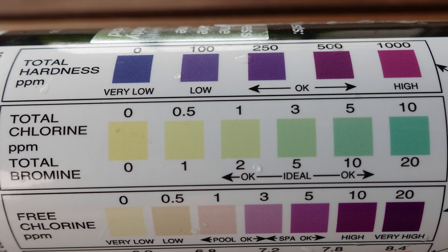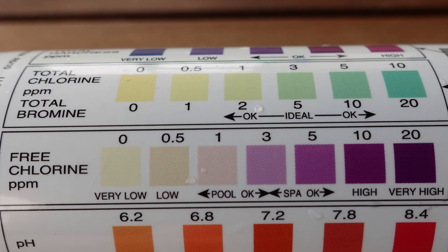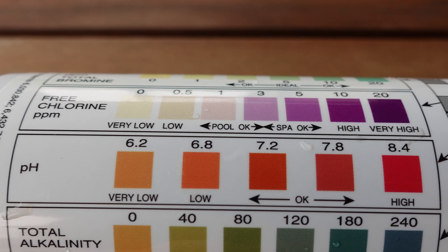In this case, we'll be able to compare the total chlorine to what's on the report. Next is free chlorine. Free chlorine differs from total chlorine in that it's the amount available to sanitize contaminants in the water. Total chlorine is essentially the sum of free chlorine and chlorine that is already combined with contaminants. If your free chlorine is low, pool shock can be used to raise the level and improve its ability to destroy the contaminants.